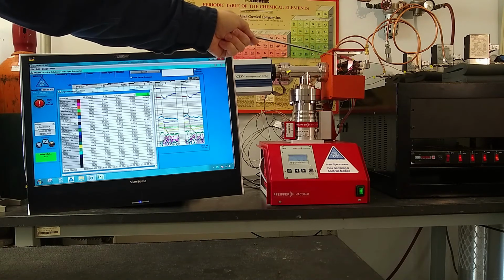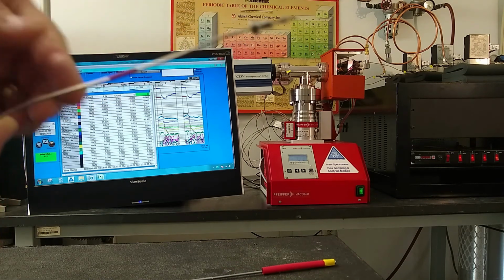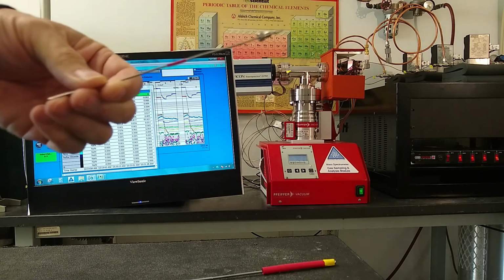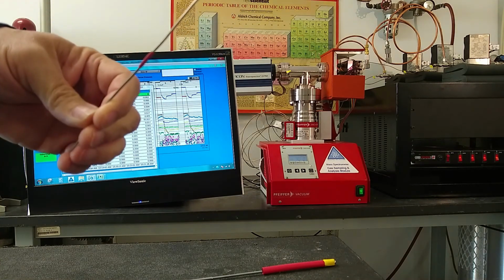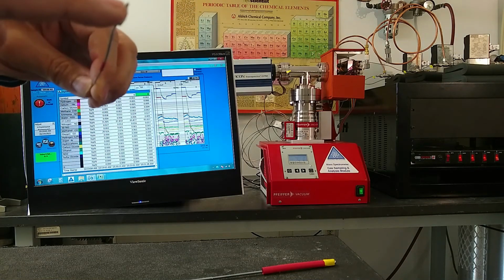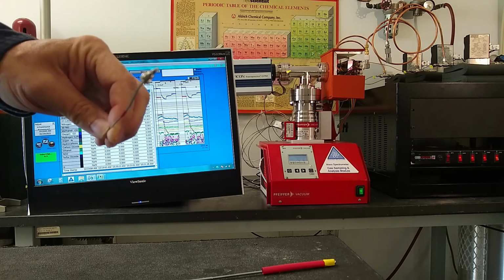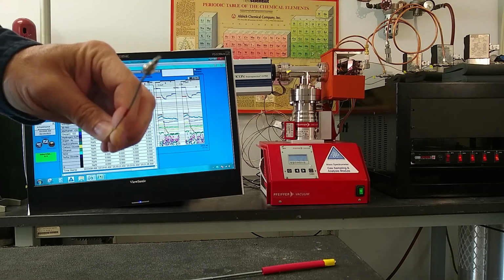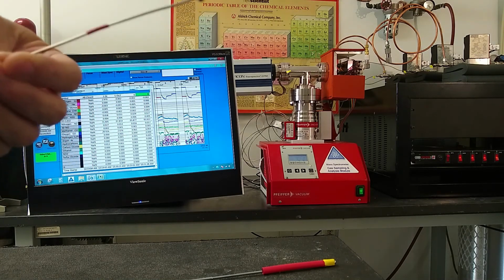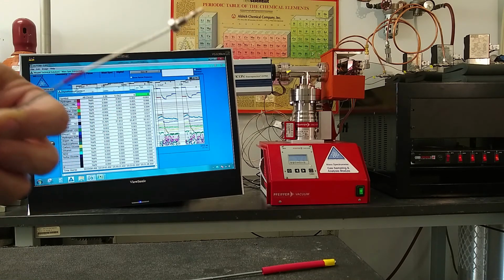So these 8 inlet capillaries are actually these 16th inch OD capillaries. These are stainless steel. What may vary with a capillary are the inner diameter. The bore throughout the center of the capillary may be various sizes based upon the operating pressure and the length of the capillary in your specific application.